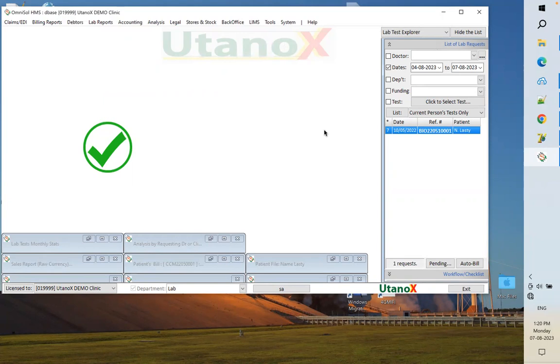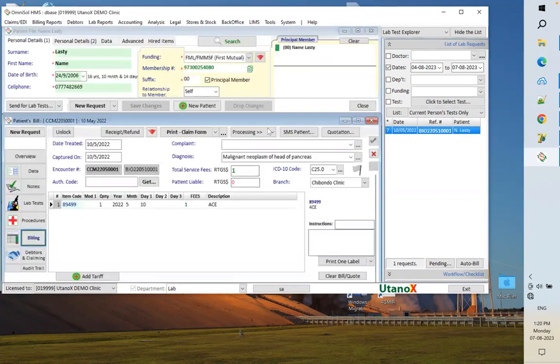Okay, so on results, you said we can email. Yes, you can email from. What about sending via WhatsApp platform? So sending under WhatsApp, you would have to sort of download the result on your computer and then attach to WhatsApp web. We have not yet directly integrated the system with WhatsApp directly. We are still working on that.